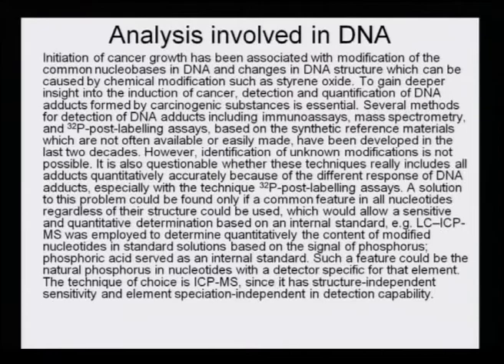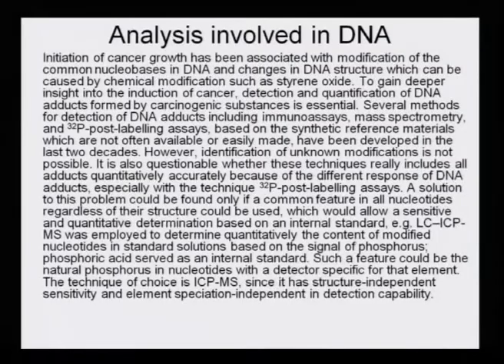That is, LC, liquid chromatography, could be coupled with ICP-MS, and this method can determine quantitatively the content of the modified nucleotides in standard solution based on the signals of the phosphorus. The phosphoric acid served as an internal standard.